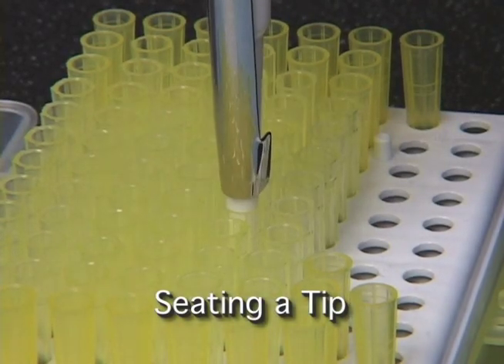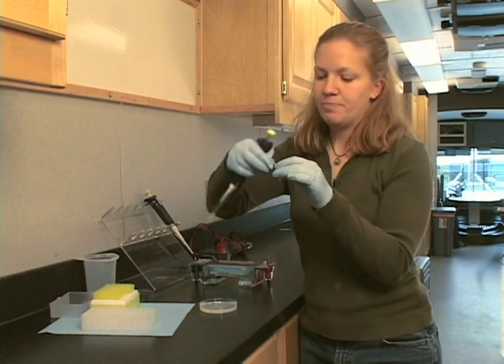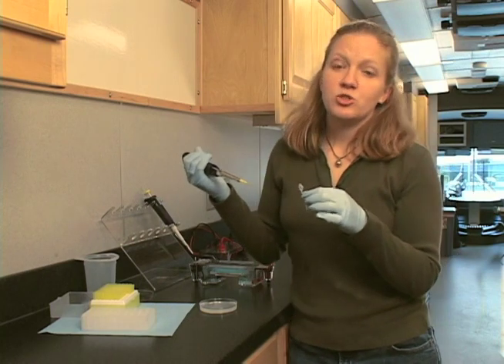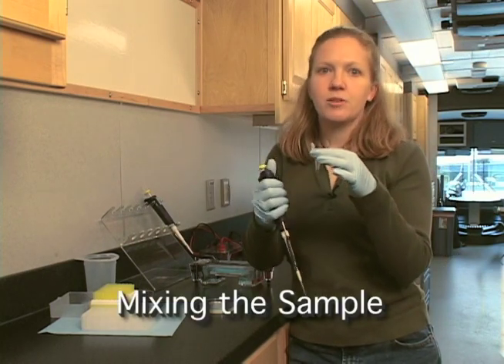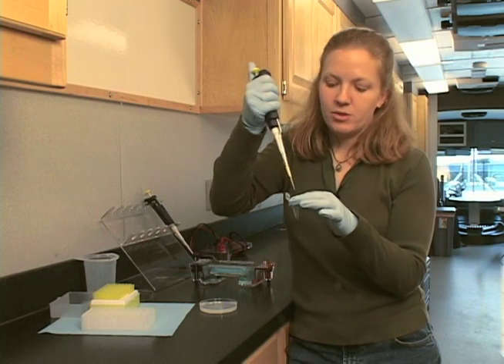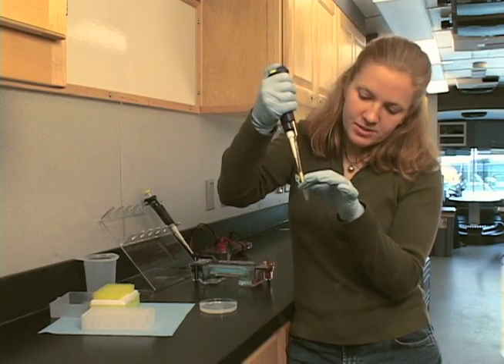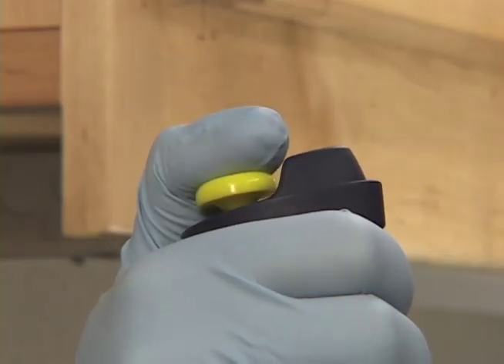I'll go ahead and seat a tip on the pipette. Here I have the sample I want to load onto the gel. Oftentimes, before you load a sample onto a gel, you actually want to mix it a little bit, because some things can settle out to the bottom, and you don't want that. You want the sample to be well mixed, and you can do that just by pipetting up and down a couple of times. Press down to the first friction stop, stick your pipette tip under the surface of the liquid, and go up and down a few times.